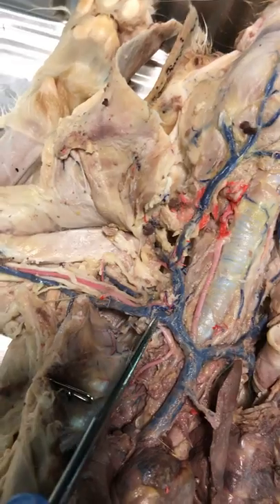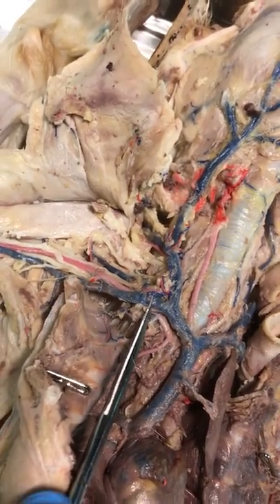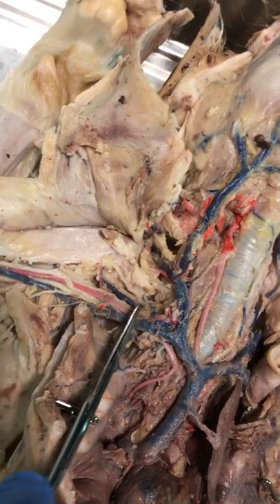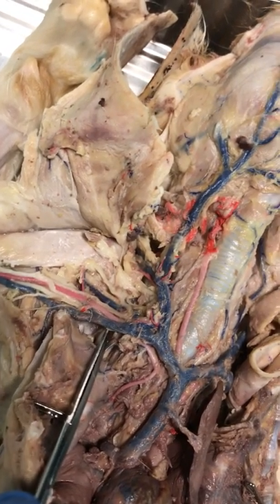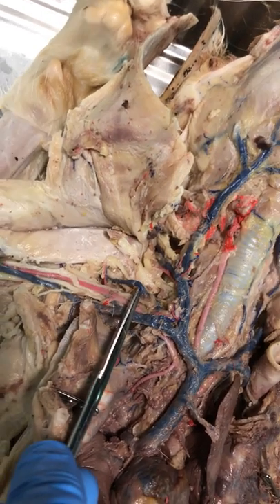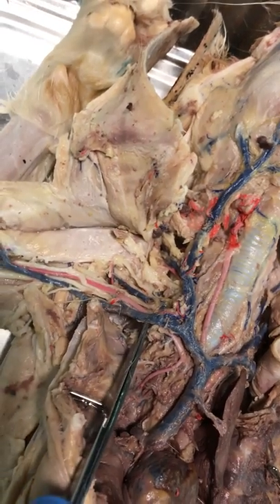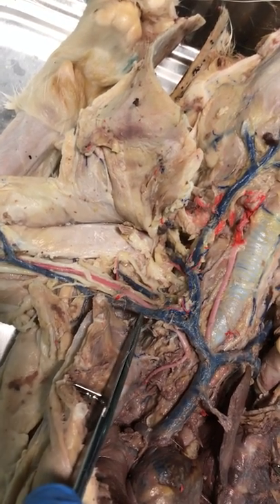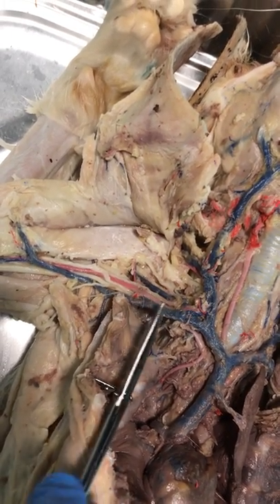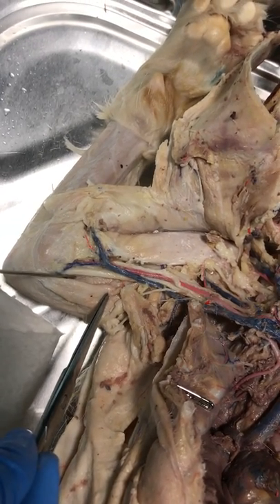Let's hold off on the jugular and go towards the arm. Here is the right subclavian vein. Right after the right subclavian there's going to be a split — a down branch and an up branch. The branch that goes up is the right subscapular vein. The branch that continues down would be the axillary — the right axillary vein.